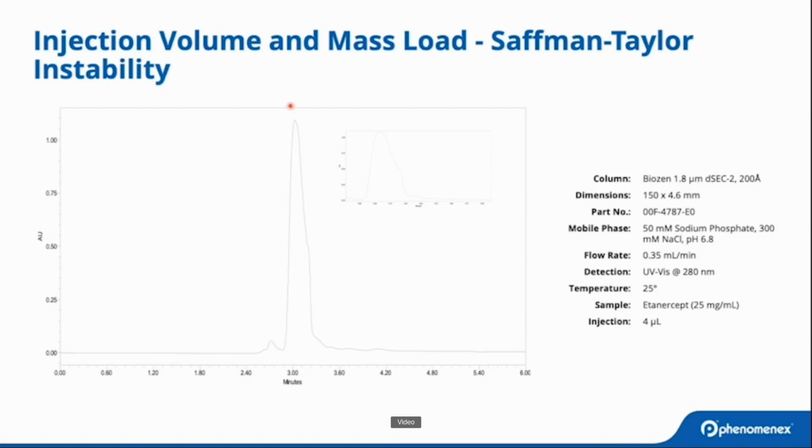And it's possible for samples loaded above 20 mg per mL to show this instability that arises due to the more viscous sample that displaces the mobile phase, and the result that you get from this is this unusual or poor peak shape. Practically speaking, for highly concentrated samples, a simple dilution can eliminate the issues, and that's why sample concentration is a critical aspect to your method robustness.